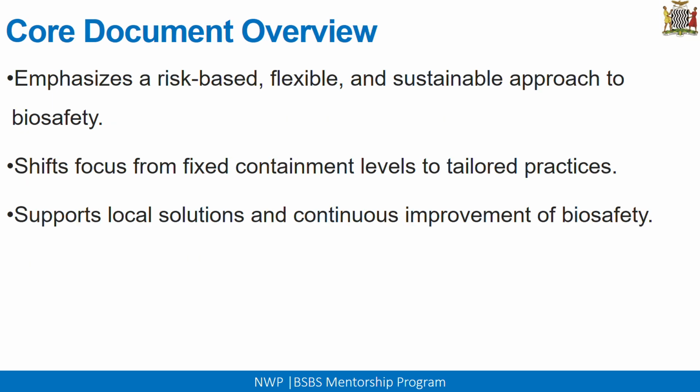So let's look at the core document overview. Like I've already mentioned, it emphasizes the risk-based approach. Whatever you do, you need to back up your implementation with a risk assessment, because the risk assessment will tell you exactly where most of your problems are coming from, depending on the risks that are mostly high in certain areas of a laboratory.